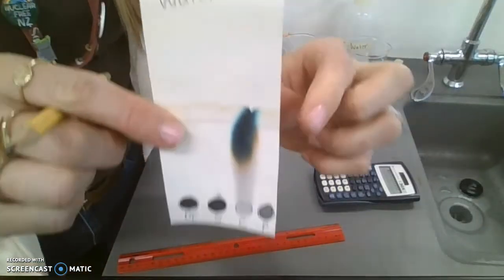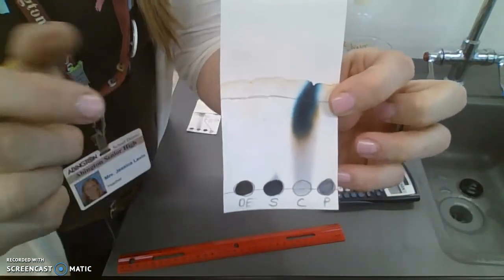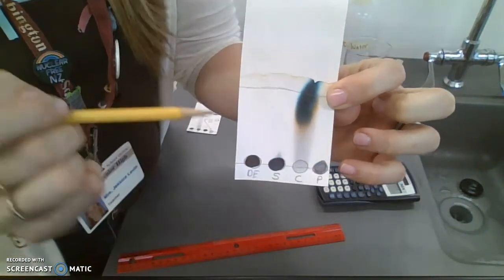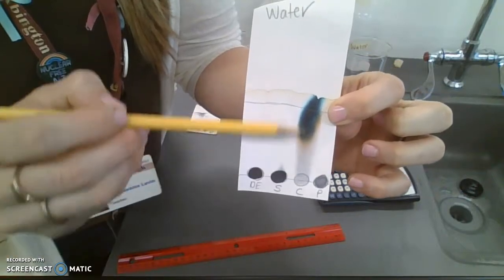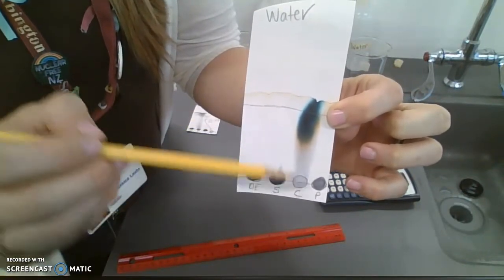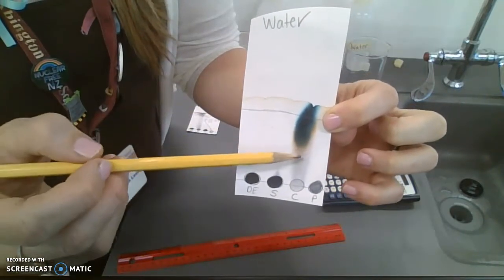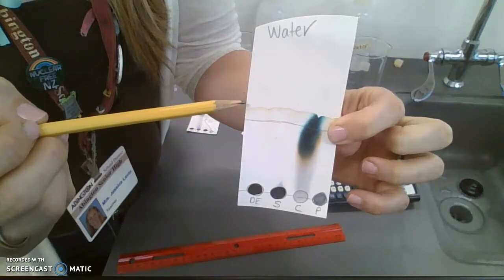Our last calculation will be for the water part. What you'll see here is that the dry erase, the Sharpie, and the pen did not move in water - they are not soluble in water. Only the washable Crayola marker moved in the water, which means that it must be made with water or a polar substance. You'll also notice that the water continued to move on the paper.